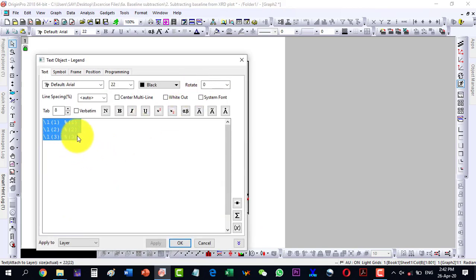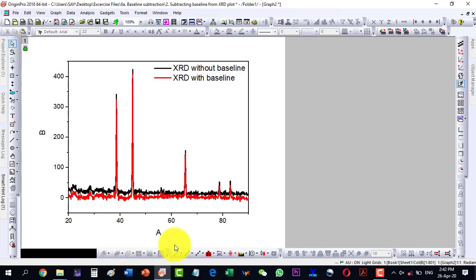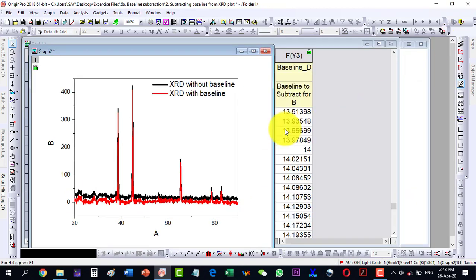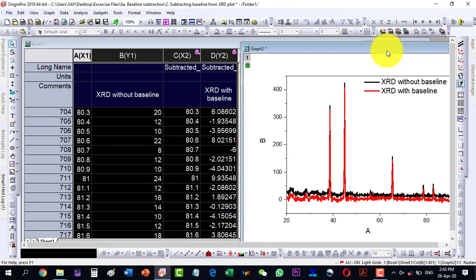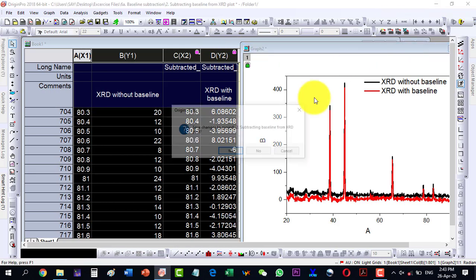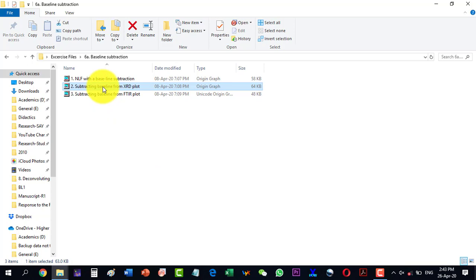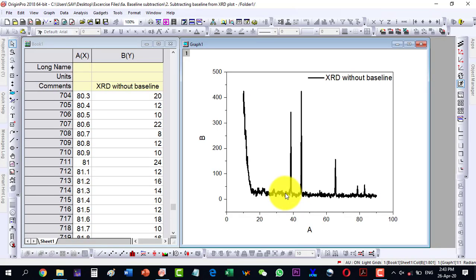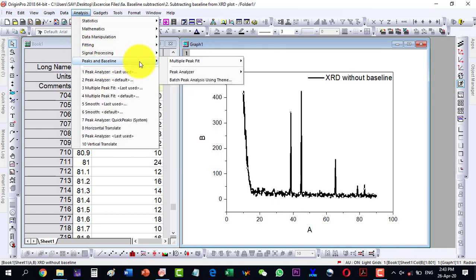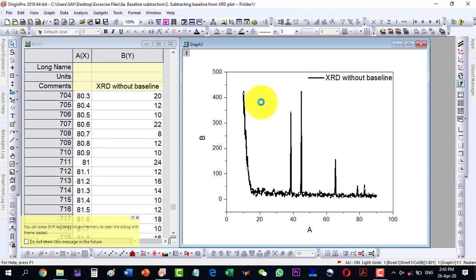We can also do this with a constant line mode. The same data — open the Peak Analyzer dialog again. Instead of user-defined, I will now select the straight line mode, which is called the constant mode. Let me go to Subtract Baseline and click Next.